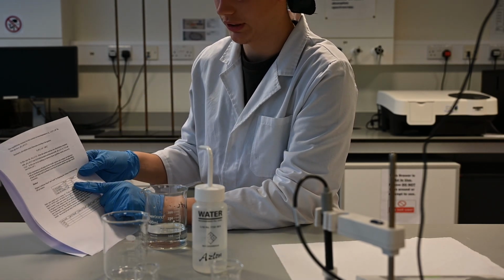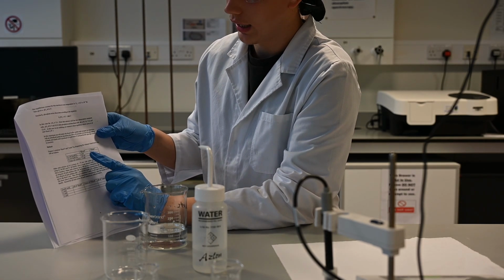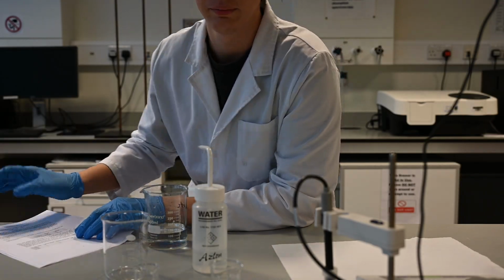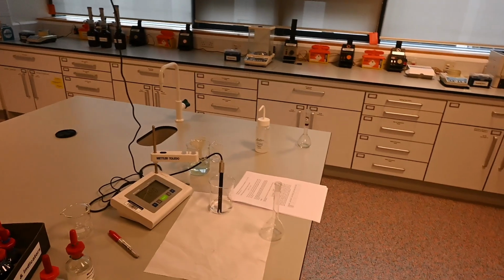So that's hopefully what we're going to be showing. The first thing we're going to have to do is make the blood solution and then make the water solution. So I'll get going on that and I'll record snippets of the process, and I'll bring you guys through it. I'm left to my own devices, so I think I'm doing this right, I say as half my head is cut off.